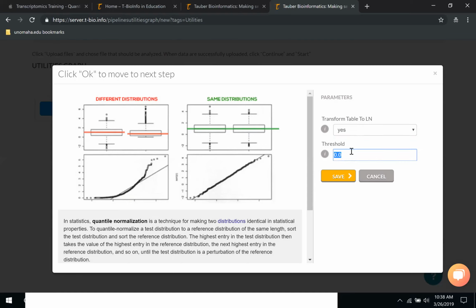We can have different threshold values. Either we could have it 0.0. The only thing is that if we have 0.0, it will normalize each and every sample, which might take a longer time, and which might not be very useful as well.